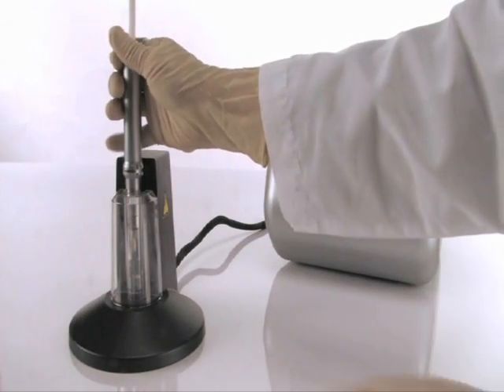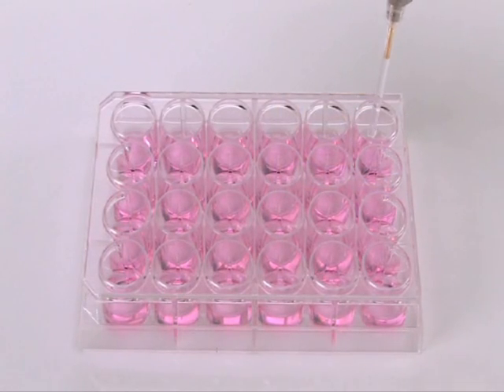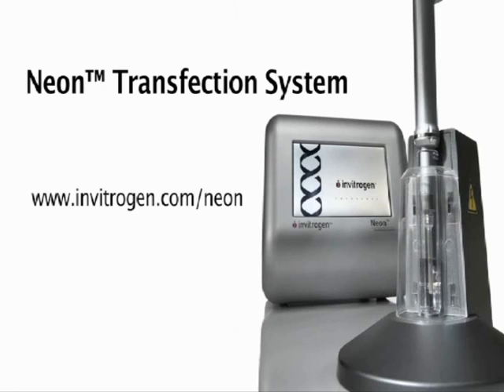Next, unplug the pipette from the pipette station and transfer your transfected cells into the tissue culture vessel. Finally, eject the tip and you are now ready for the next sample. The NEON transfection system. Shockingly simple.